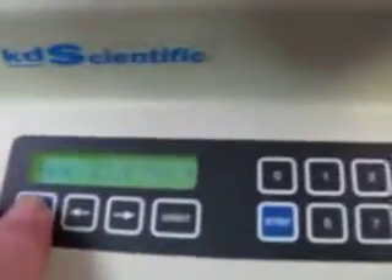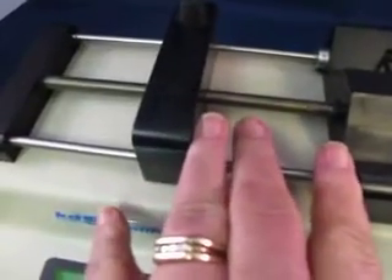That shows the rate. You could press this — this thing is running and then this slides back and forth. It holds multiple types of syringes, and if you turn this knob here, it catches that and you can see it's moving. It's moving like snail snot, but you can feel it's definitely coming in.